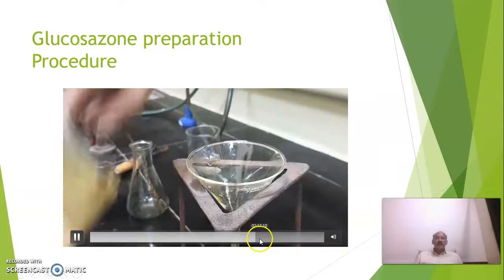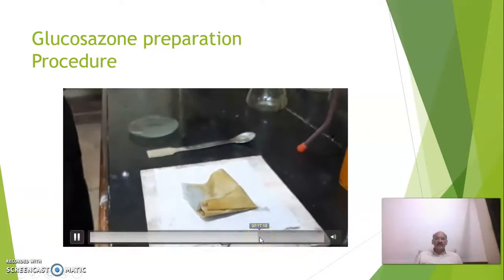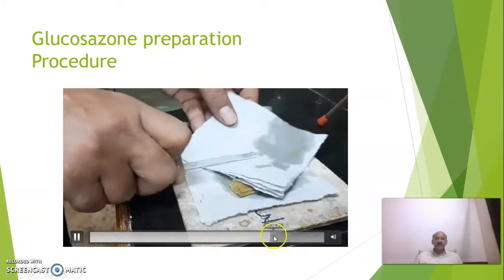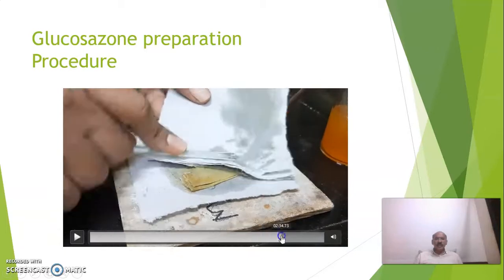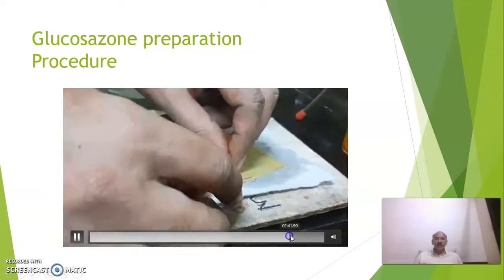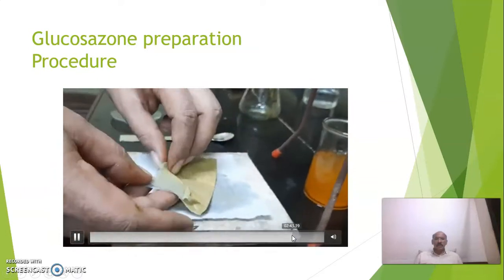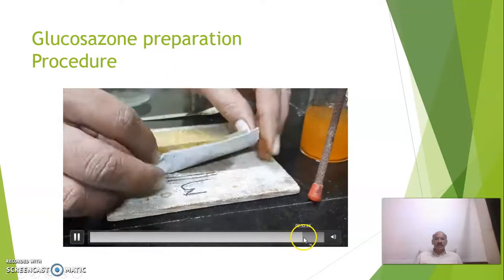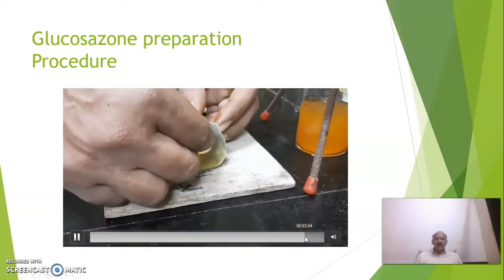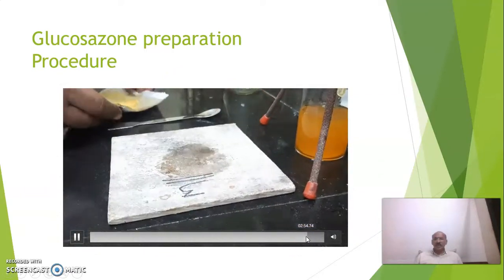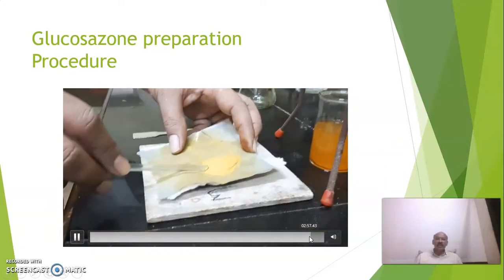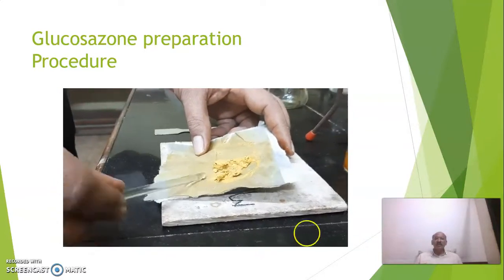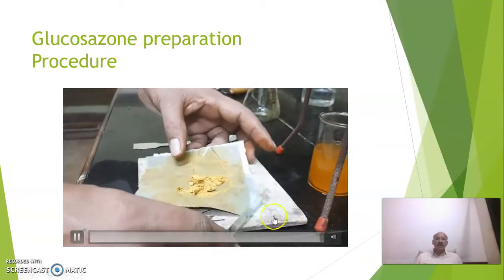Then we will remove that filter paper, we will press that by using some filter papers, and we will keep it for drying. Yes, before drying we will purify it by using ethyl alcohol as a solvent. We will dissolve it in ethyl alcohol, and when we use alcohol, we have to use water bath for the heating.